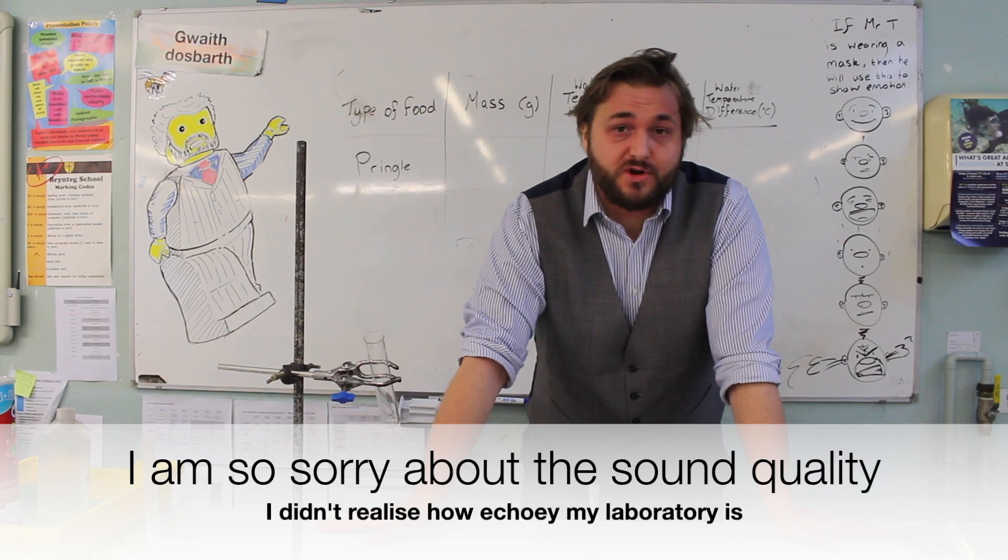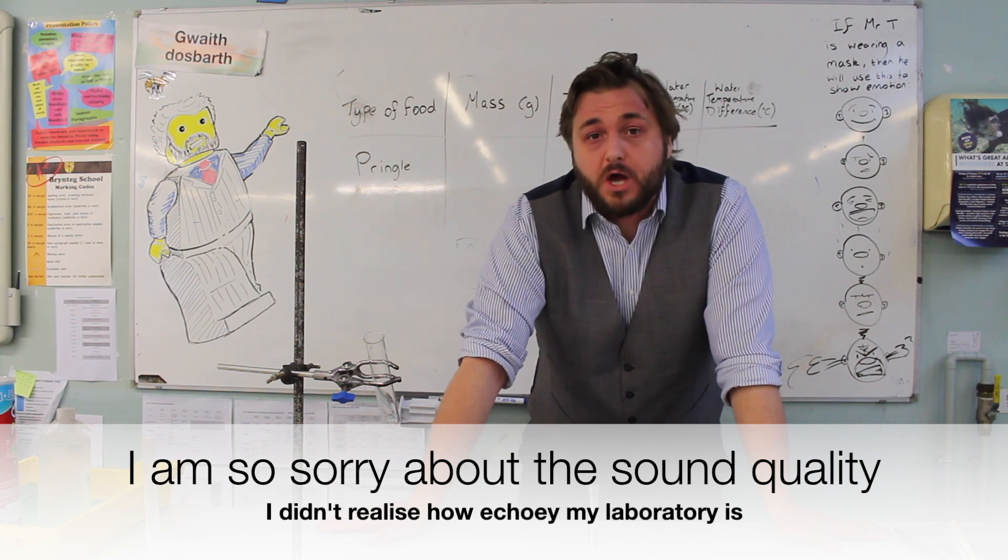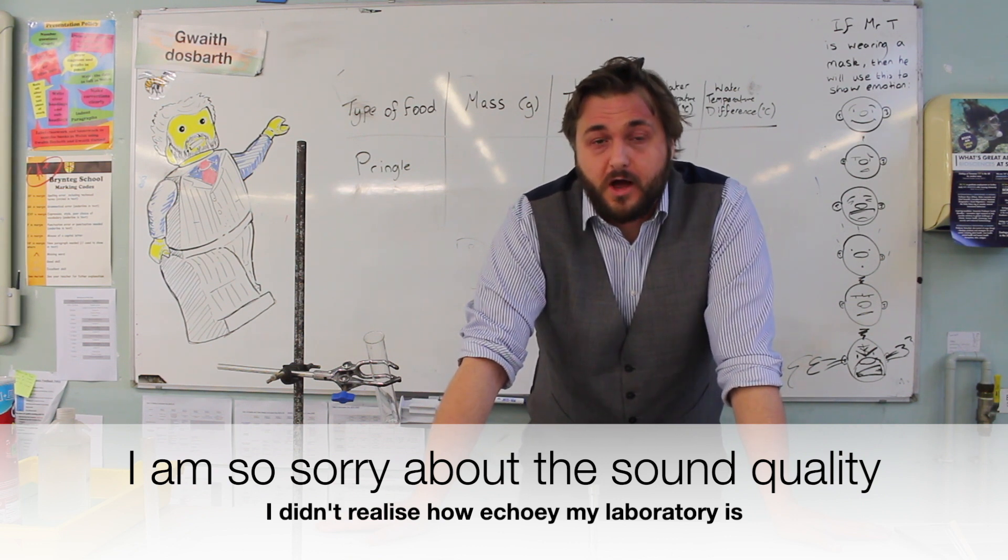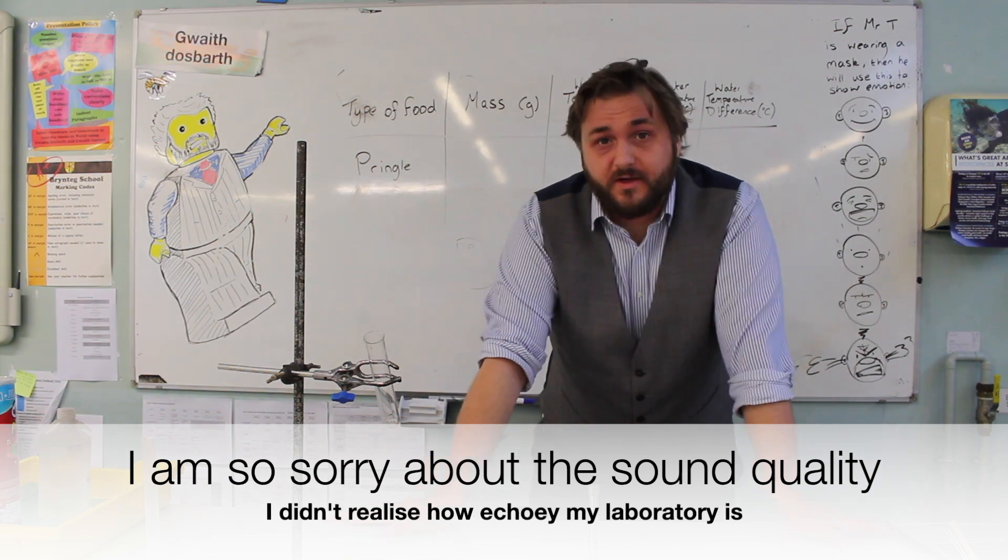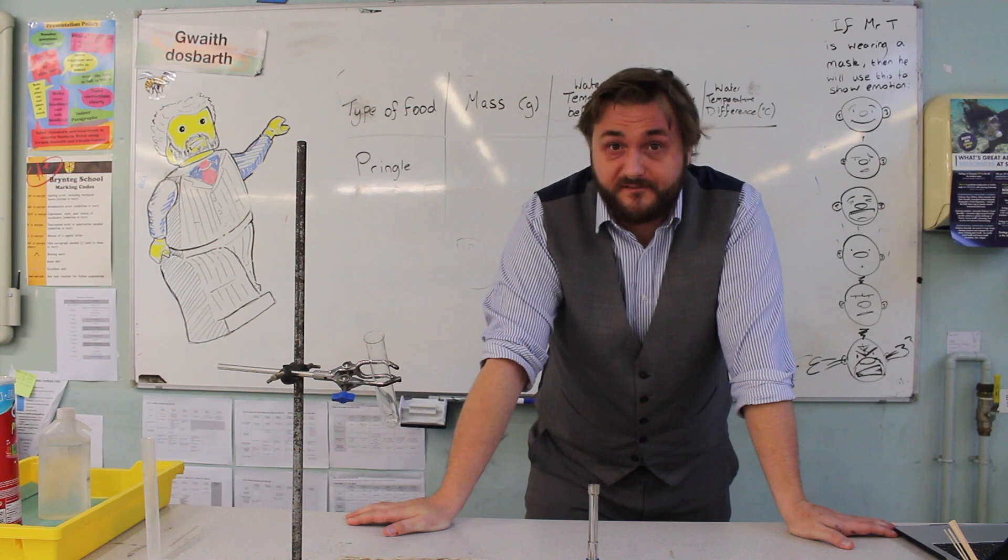Good morning. This is a demonstration of the WJEC Key Stage 4 GCSE practical known as the burning food experiment. The official name for it is the investigation of the energy content of foods.